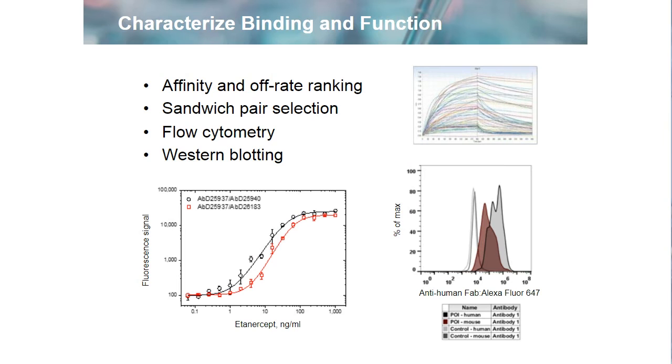So if we have established the specificity of the antibody and selected the appropriate format or formats, either labeled or unlabeled, another key consideration is whether the antibody actually works in the intended application. So in custom antibody generation projects, a potentially large number of hits must be consolidated down into a manageable number. And this is something that can be built into the screening process so that those clones which look most promising in the intended application can be prioritized. So with an in vitro antibody generation process, incorporating these evaluation steps on different platforms midway through the generation process is relatively straightforward. And the process can literally be frozen if samples need to be sent off to customers for more esoteric testing, for example, in cell-based assays, before a decision about which clones to progress is finally made.